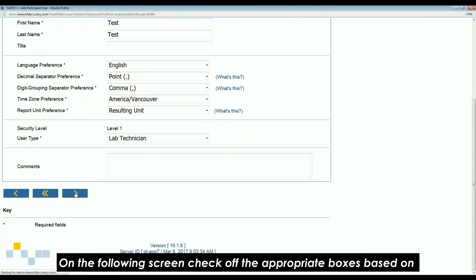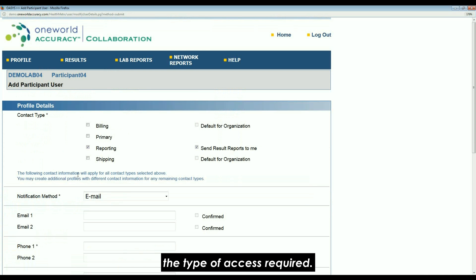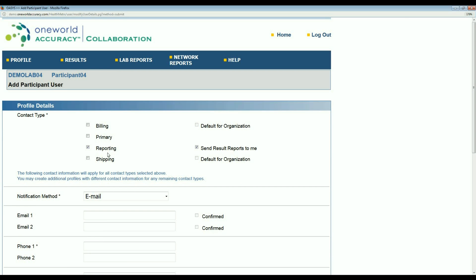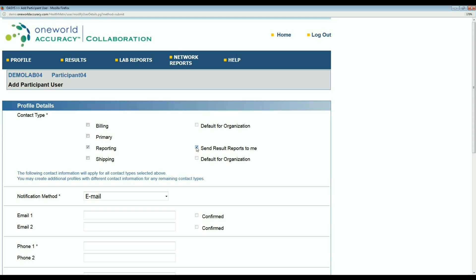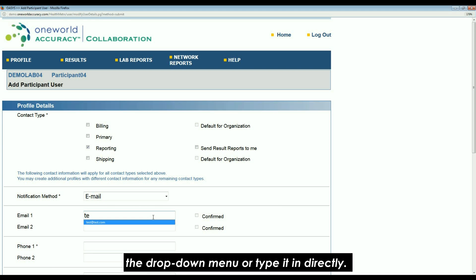On the following screen, check off the appropriate boxes based on the type of access required. If the user wants to submit results but does not want the reports, uncheck the send results report to me option. Enter all available contact information and select the address from the drop-down menu or type it in directly.